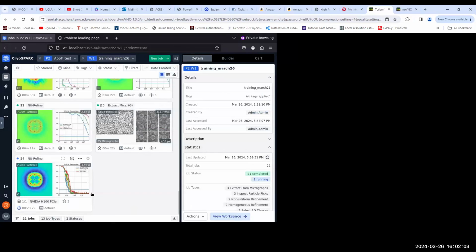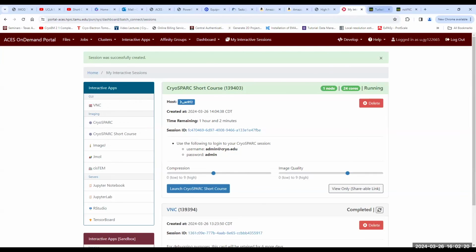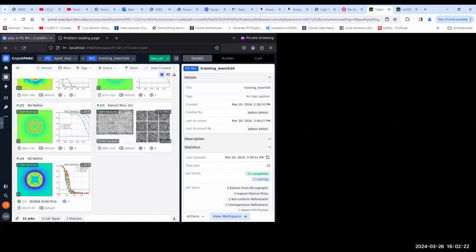And if you still have a lot of processing, at times we do have 4 H100s on a compute node. If using 2 GPUs is not enough, we could probably add a configuration for 4 GPUs. Okay, thanks. You're welcome.